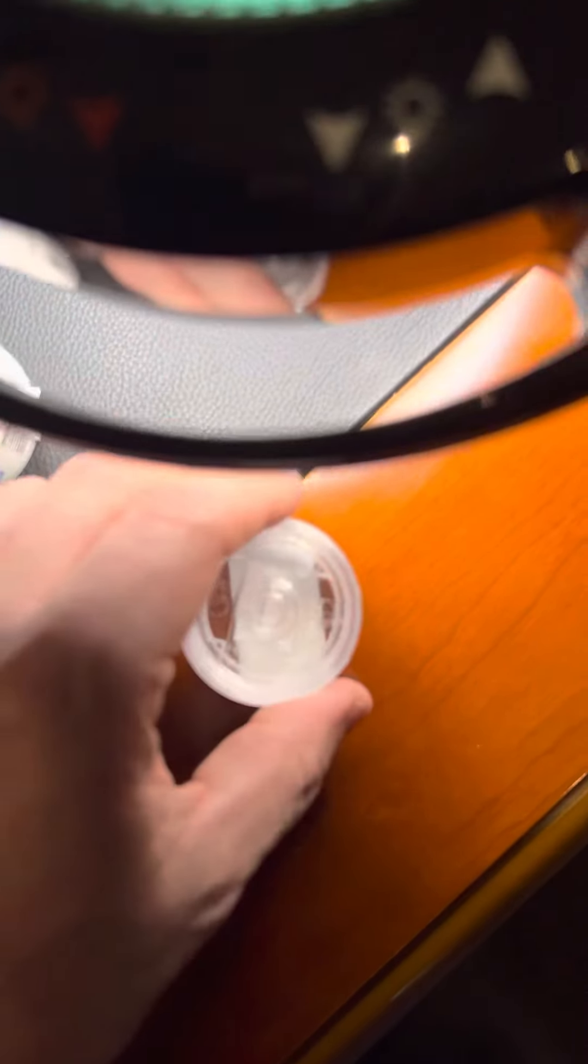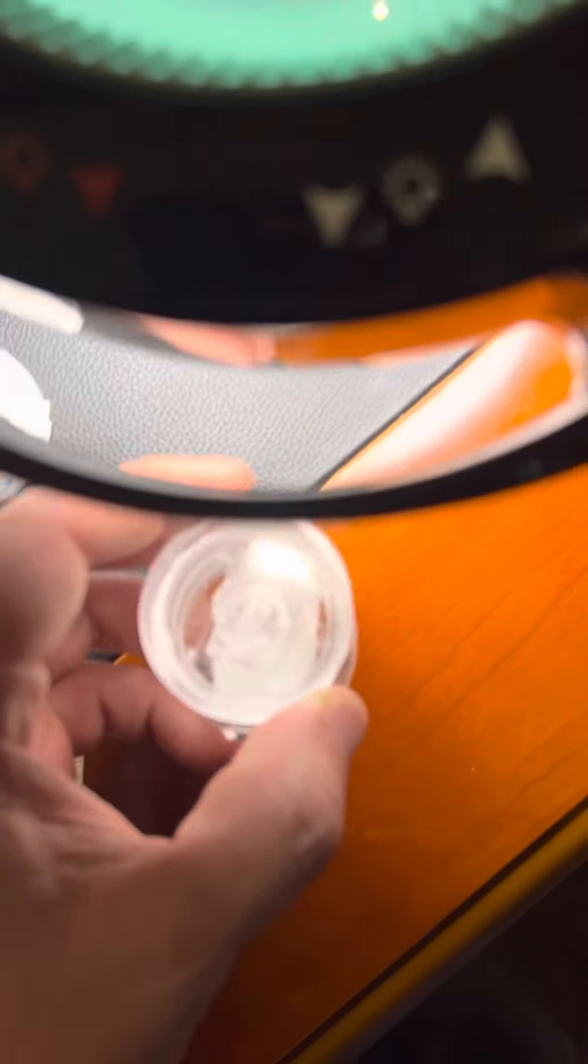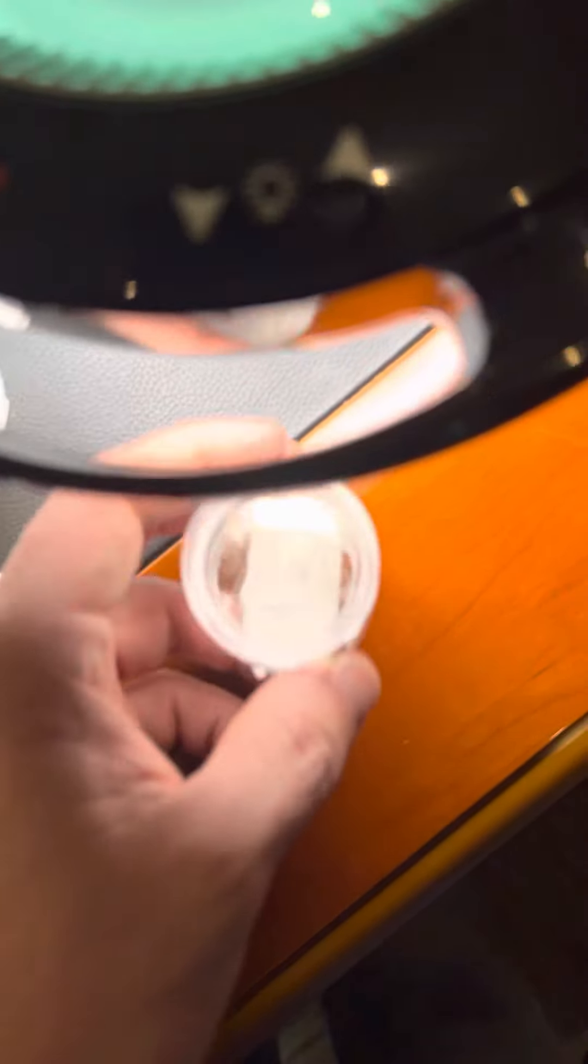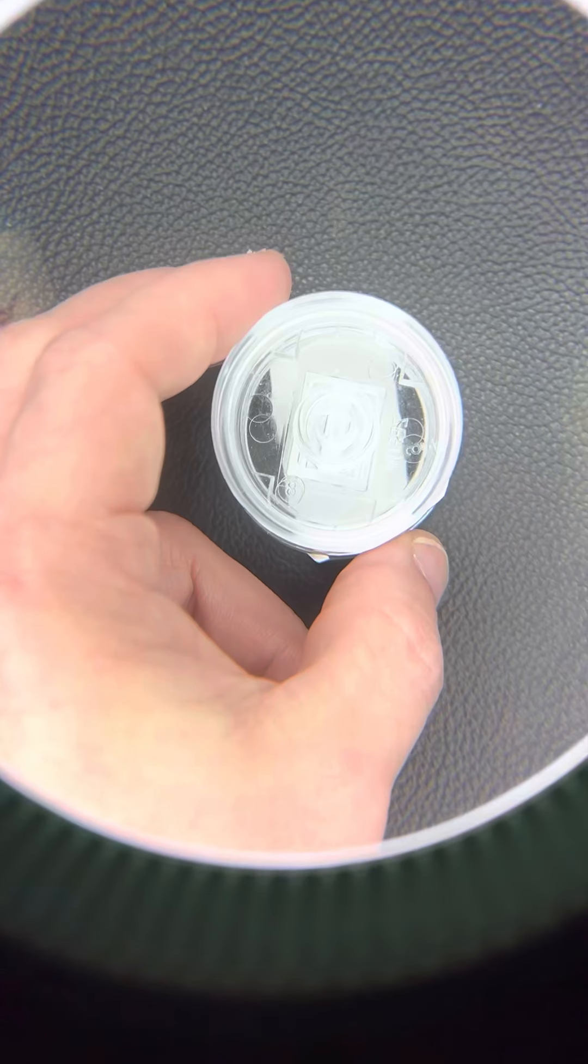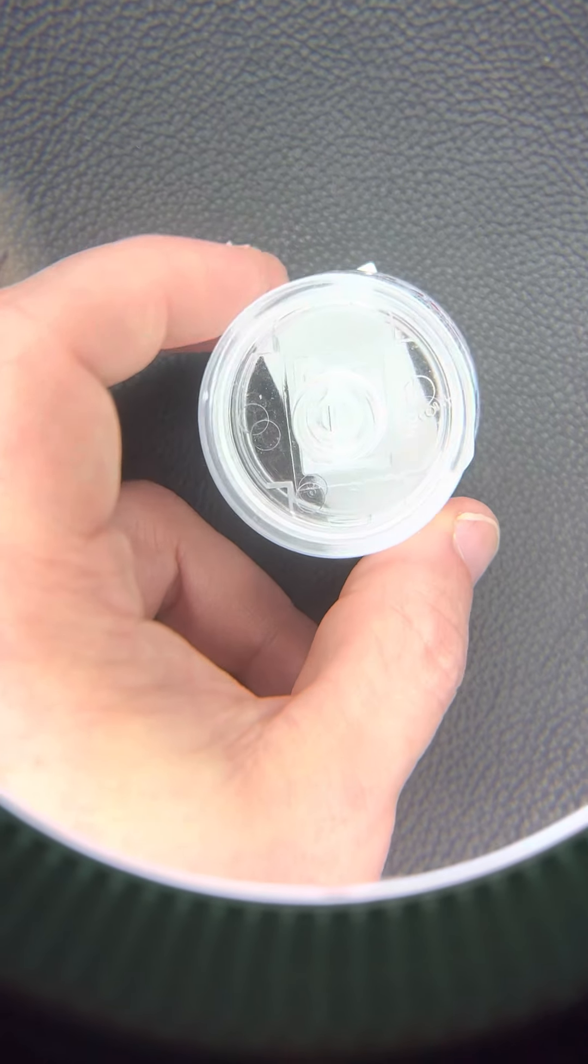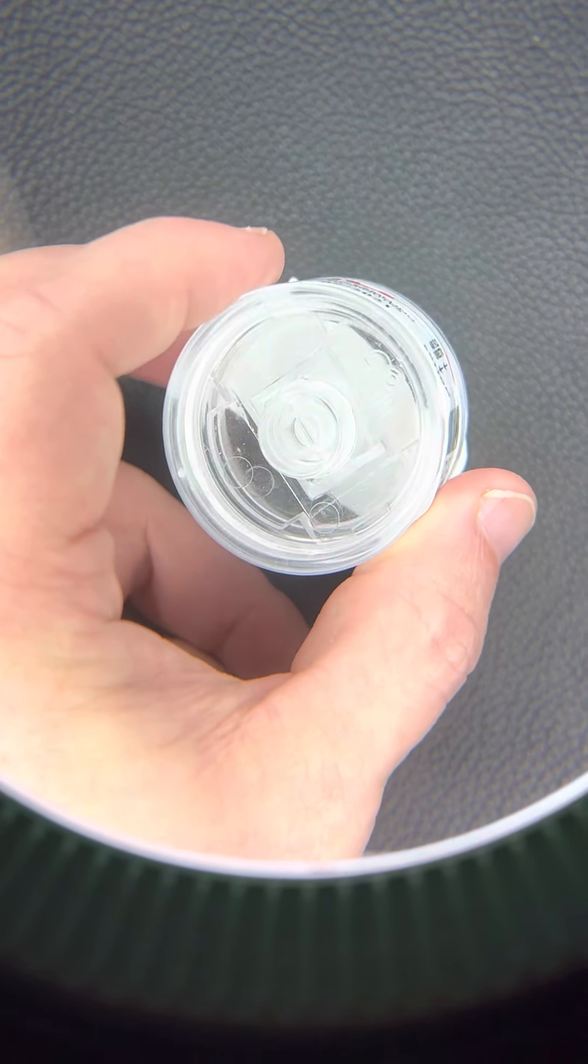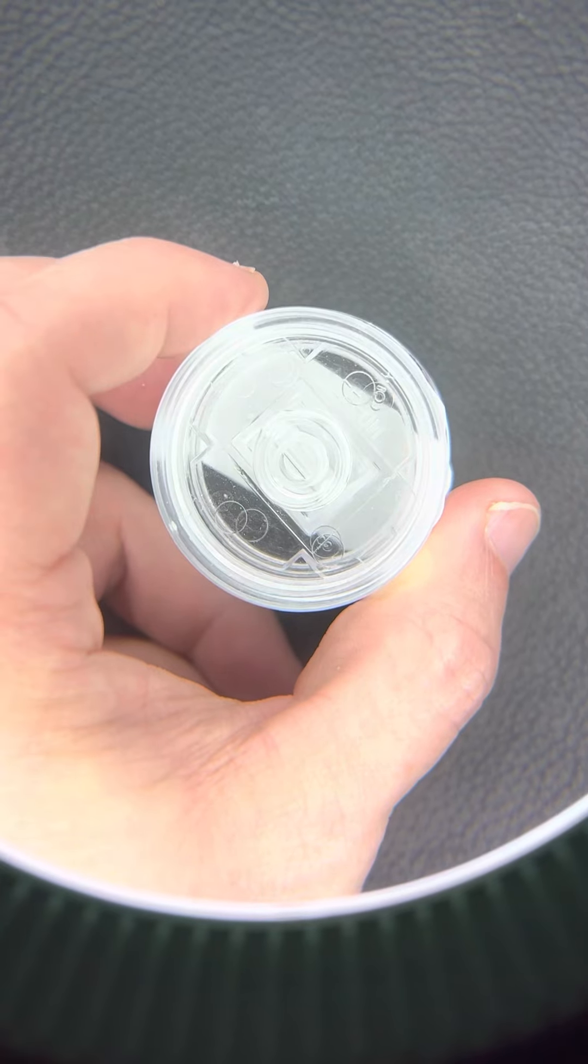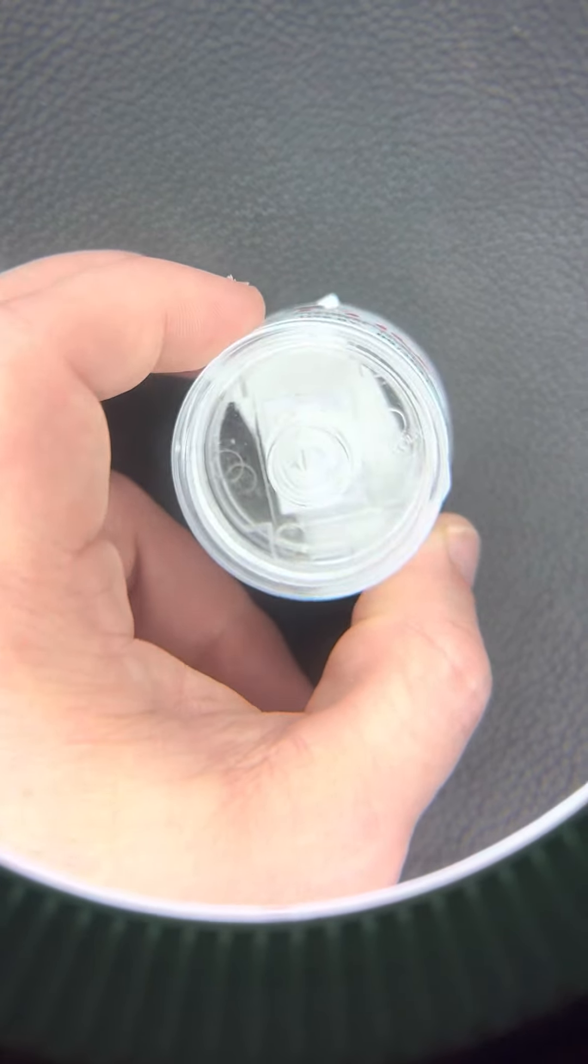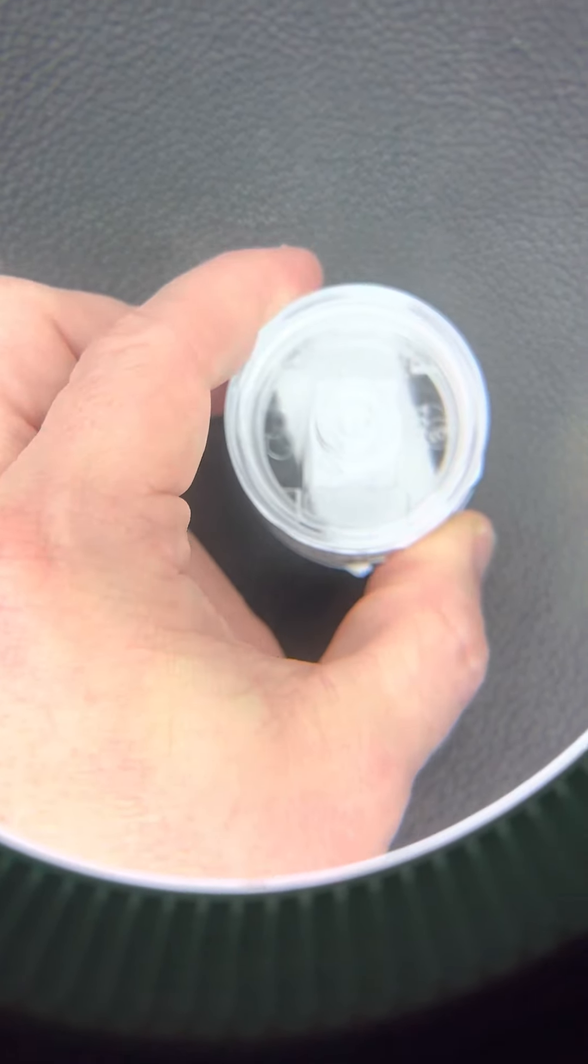Let's look at these plastics that were, quote, made by ProLab. Wait a second. Does that say Zefon right there? Yes, it does.